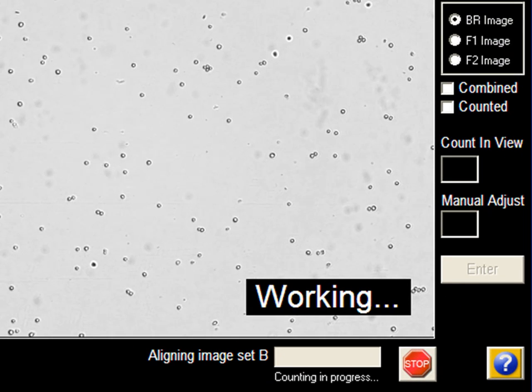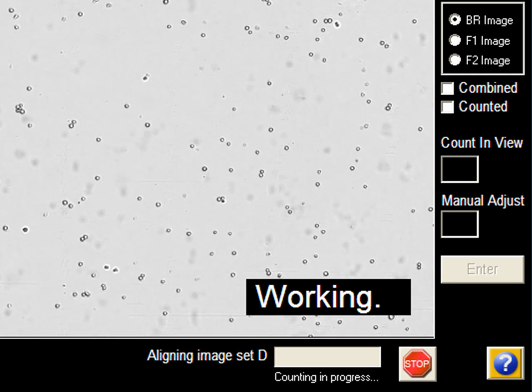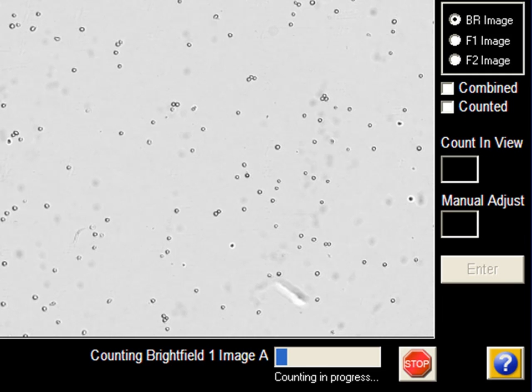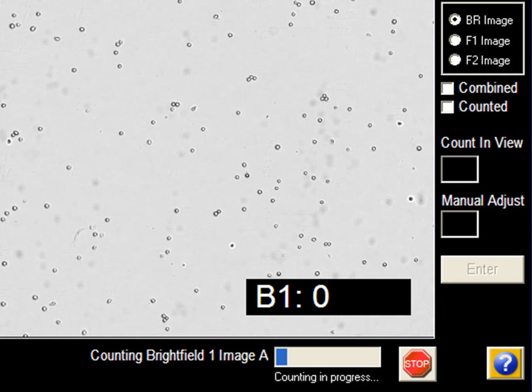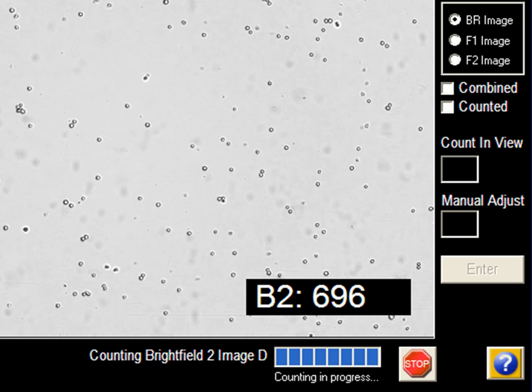In less than three minutes, the Vision CBA takes multiple cell images and analyzes the images based on preset parameters for the mitochondrial membrane potential assay selected.